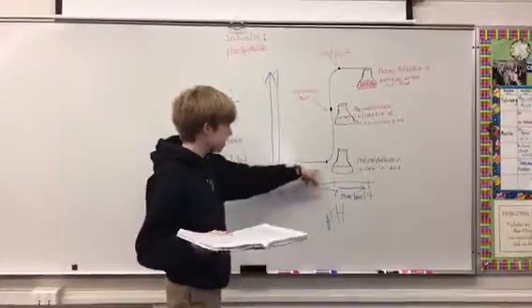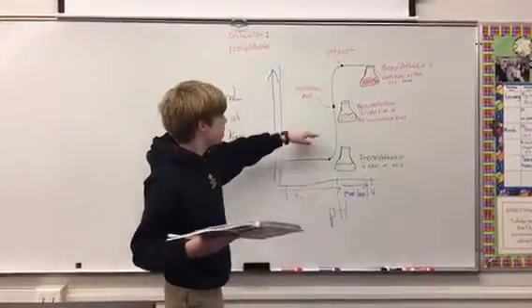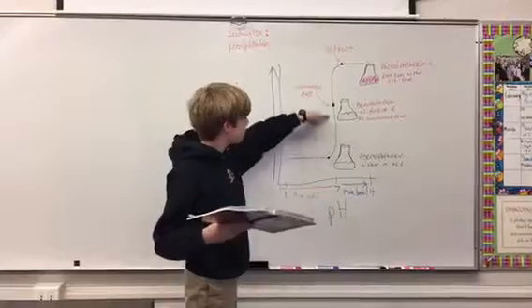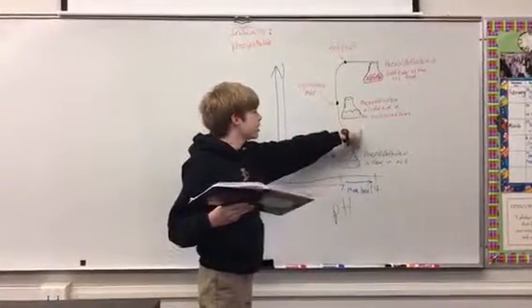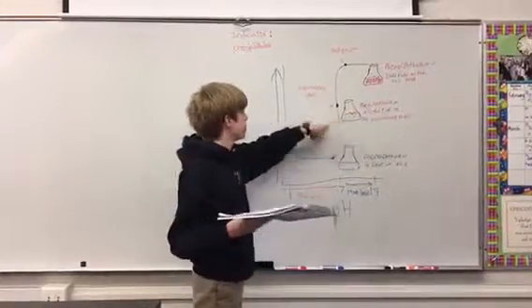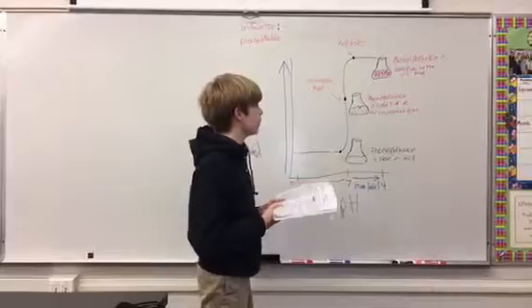See, we have the acid right here, and it's clear in the presence of the indicator phenolphthalein. Then you see it goes quickly up to the equivalence point. Here the phenolphthalein is light pink at the equivalence point. Then it slowly gets around to the end point, where phenolphthalein is dark pink.